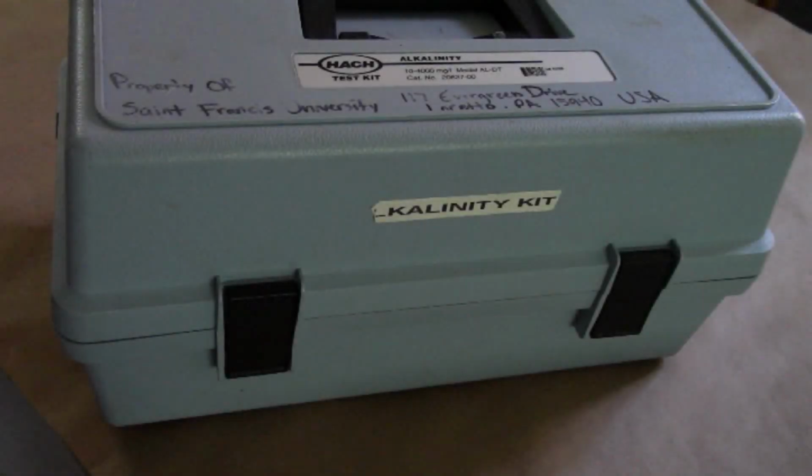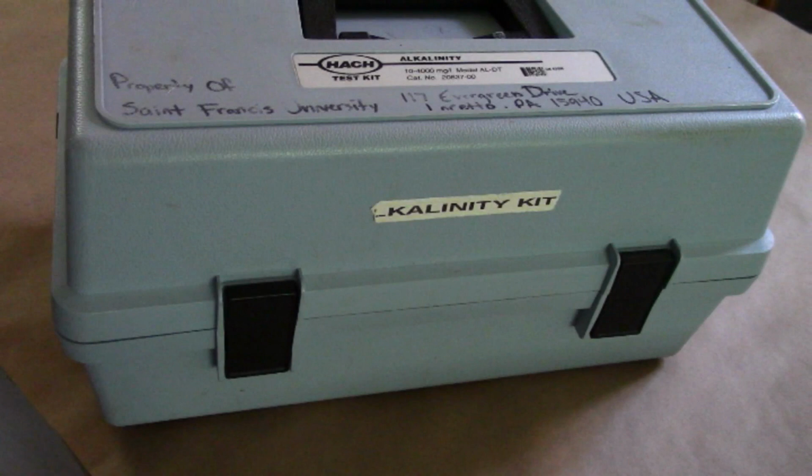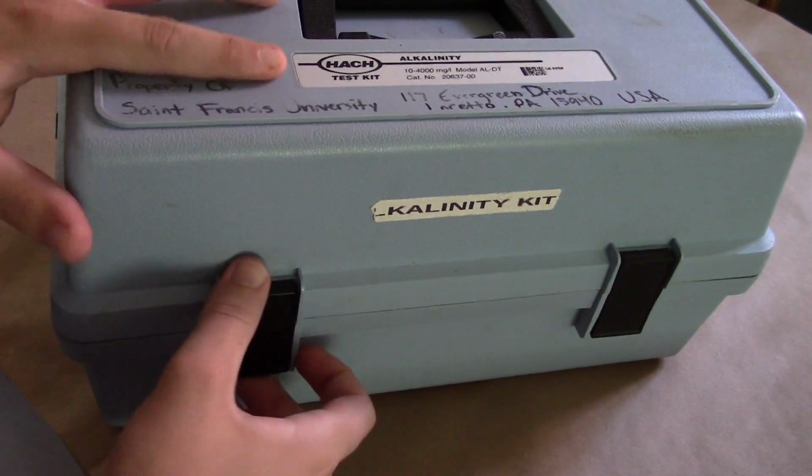Today we will be testing for alkalinity in terms of milligrams per liter as calcium carbonate. Before we actually try it out on a stream, let's take a quick look at the Hach alkalinity test kit and the equipment inside.